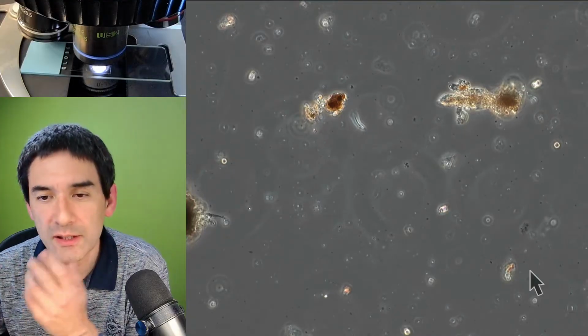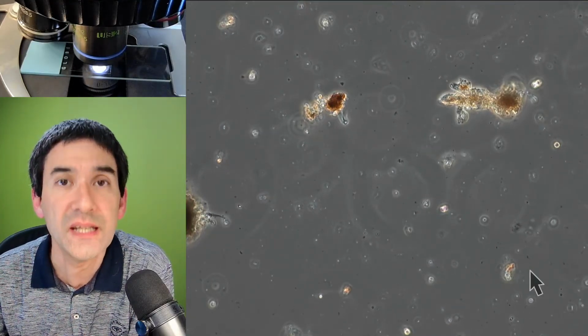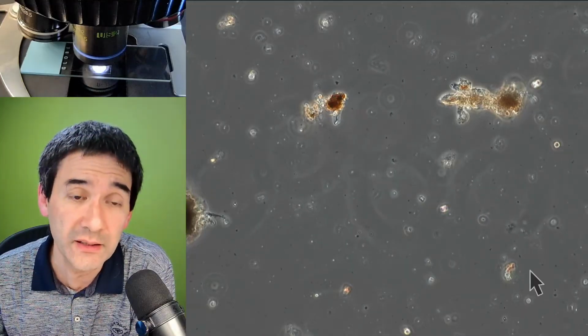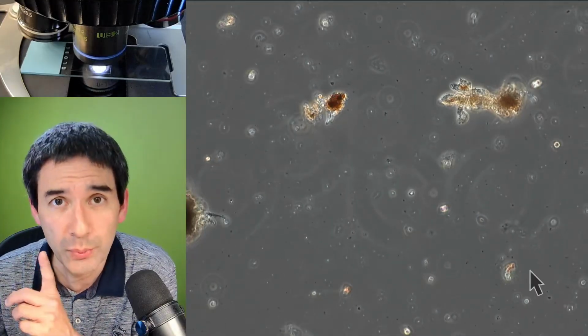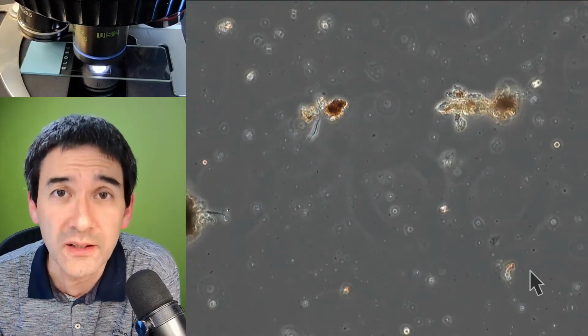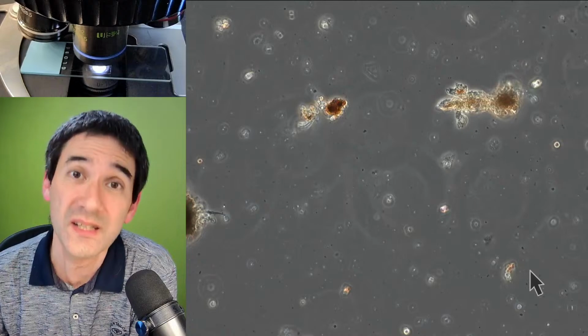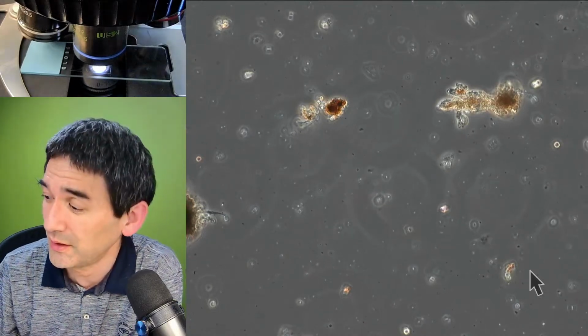Would the bacteria stand out in bright field when staining with methylene blue? And the answer is yes. I like to use crystal violet as well. However, what's important is that these stains are so unspecific. They stain pretty much everything. Sometimes it's difficult to still see if these are bacteria or not. So that's a little bit of a problem with staining.